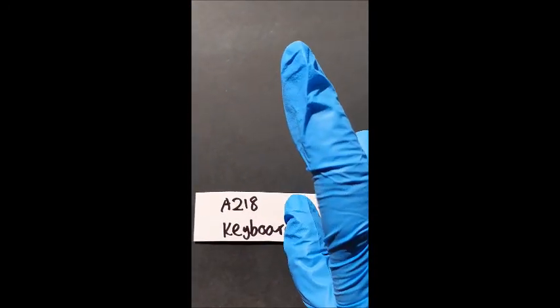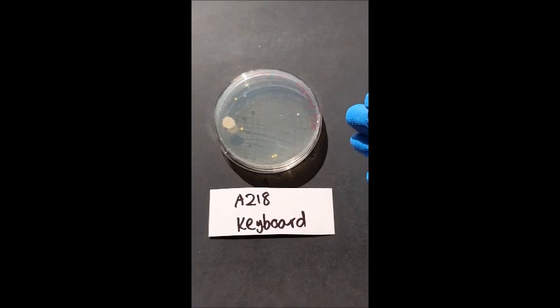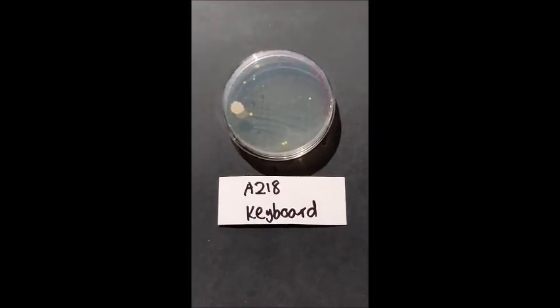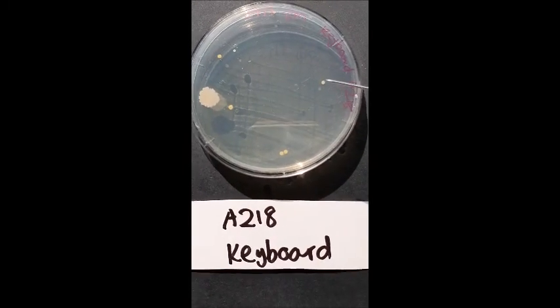Now, what about the keyboard? The keyboard also gets wiped down, but because of the shape of the keyboard with all the crevices, there are more opportunities for bacteria to grow and it's hard to get in there to actually clean it out. So I think we've got like 3 different types of bacteria here.